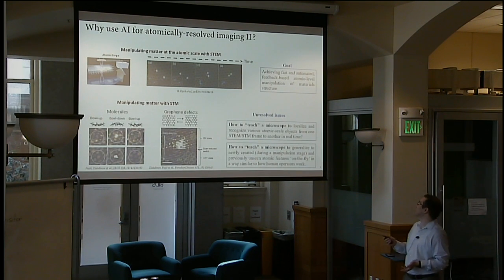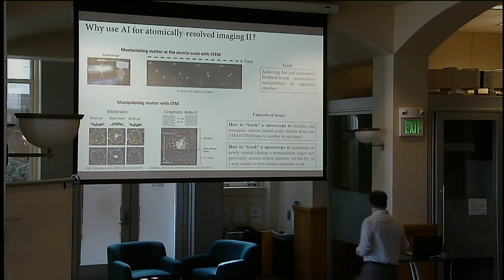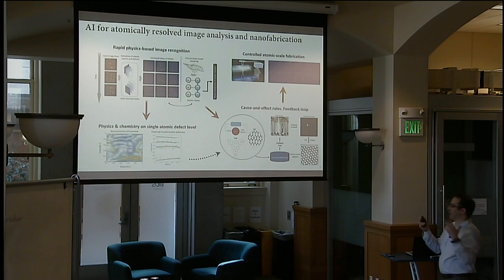So what is really needed here is that we want to have an image-based and physics-based feedback for atomic level manipulation of materials structure. All right, in case what I said here was very confusing, I put everything together on just one slide, okay?